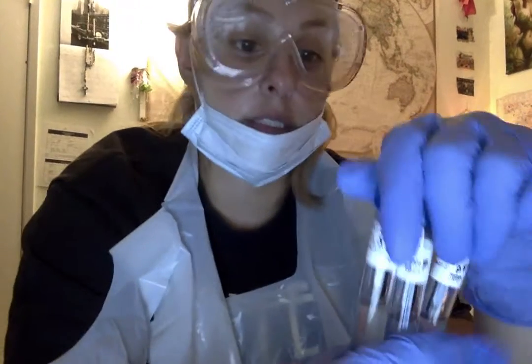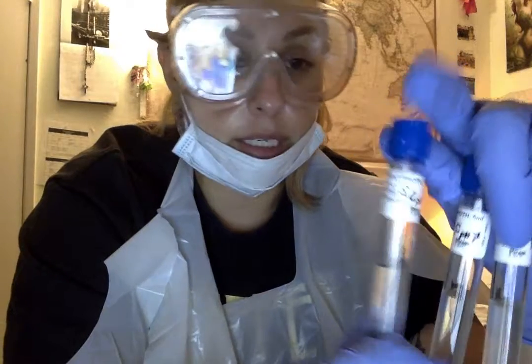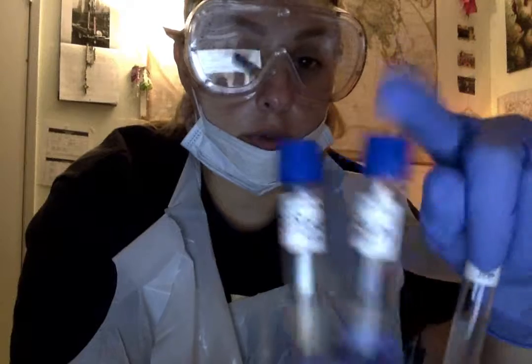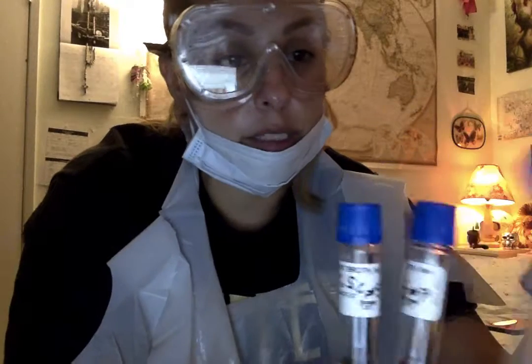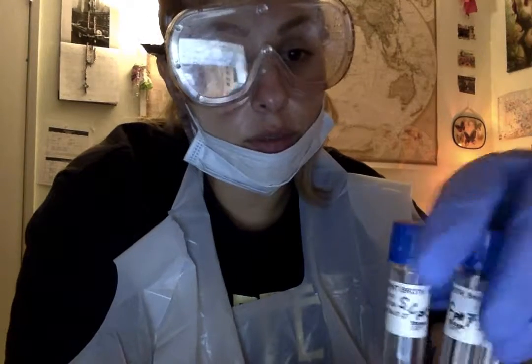And so we can tell with the S. cerevisiae, this culture did grow in these levels. This is the HCl. This is cerevisiae on its own, already at the neutral level, and this is with the addition of NaOH. And so those were my results.